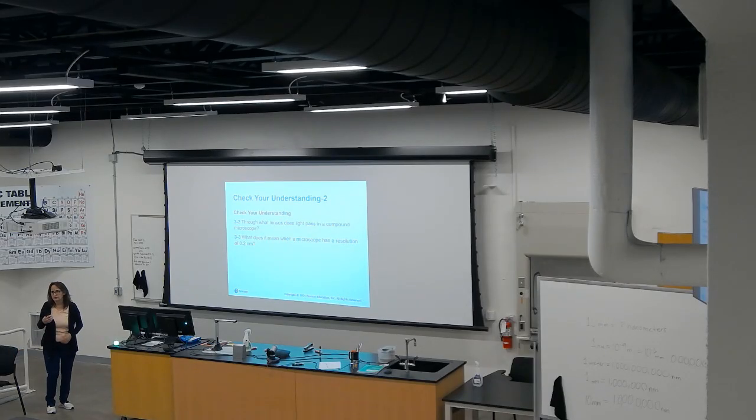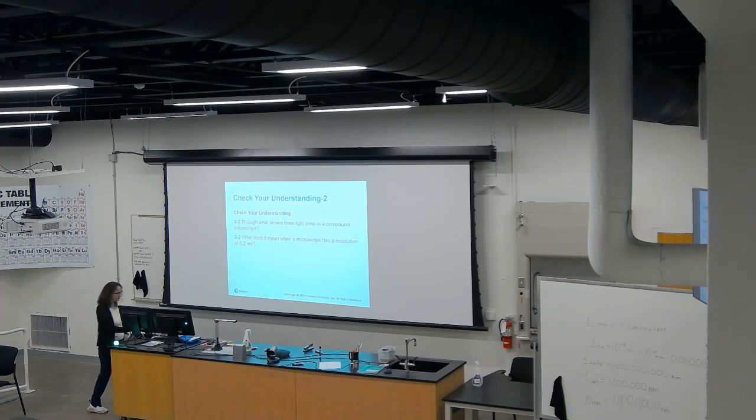I took out my phone because if I compare my phone to your phones, yours has better resolution taking pictures. You can see the objects sharply. More sophisticated, less sophisticated. Compound microscope, scanning electron microscope. With your phones, you can even see what the people are thinking.